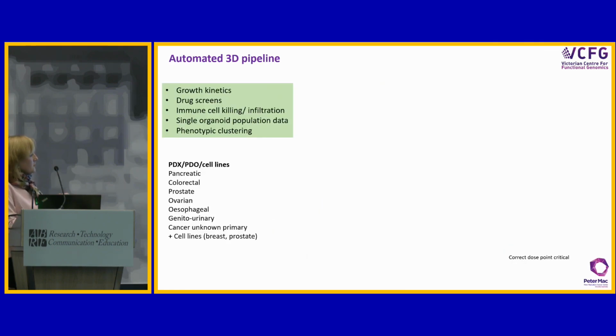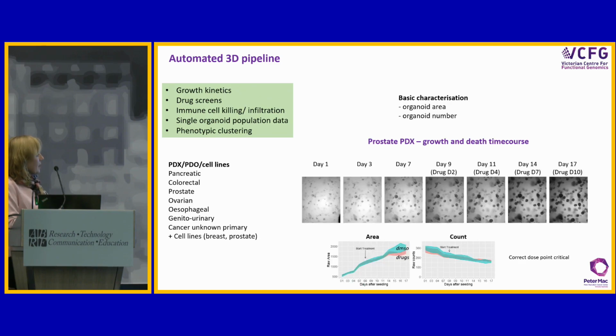We can now use this pipeline for all these different applications. We've done this in a huge range of PDX and PDOs throughout our institute. And it really looks like this. Using a prostate PDX, we've been able to measure growth over time.